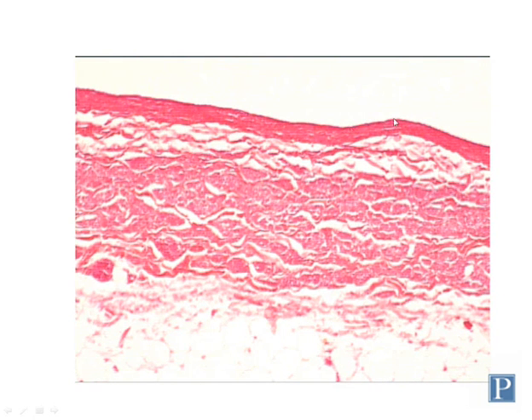The tunica intima in large veins is not particularly well defined and oftentimes can be hard to distinguish from the underlying tunica media. So be able to identify large, medium, and small arteries and veins, as well as arterioles and venules and capillaries. And again, the way to do that is to really try to count the number of layers of smooth muscle in the tunica media using the guidelines that are set out in the lab manual.